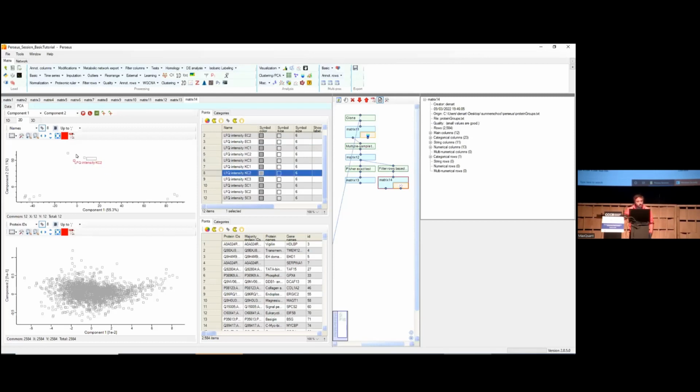Yeah, exactly. And different cell types are grouped separately. So if, let's say, this point were instead of KC, HC, then you would know you have a problem, because that doesn't make sense. This is one way you could use PCA. That is the biological question we are answering now: did I do something wrong with my data? Did something unexpected happen?